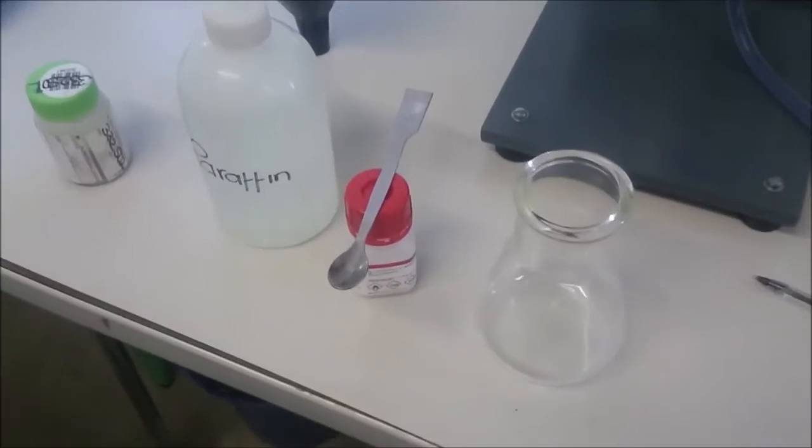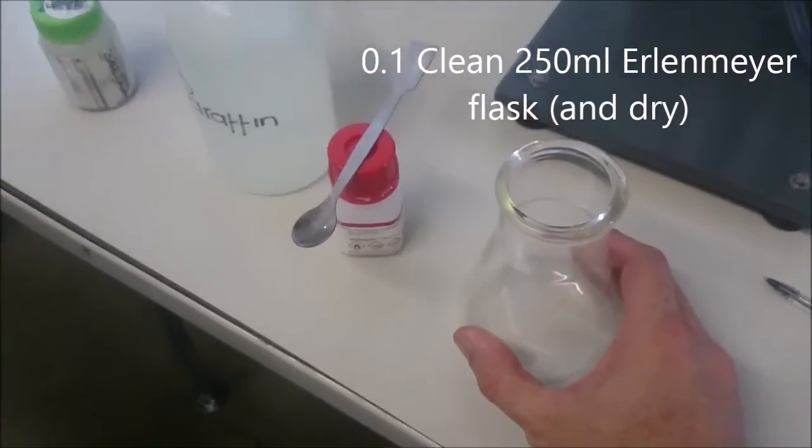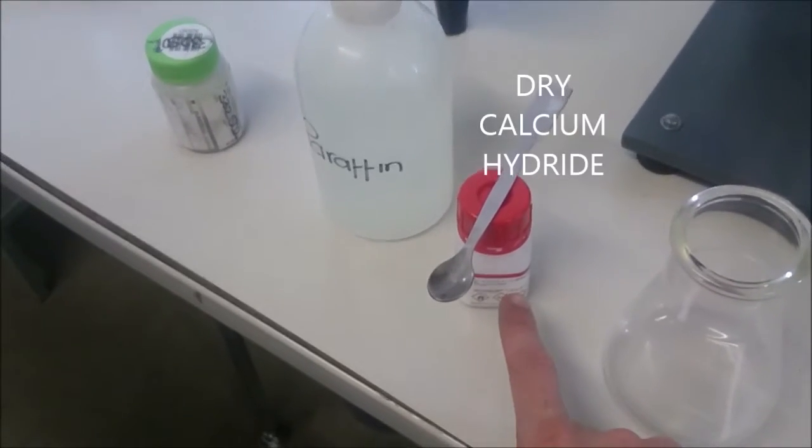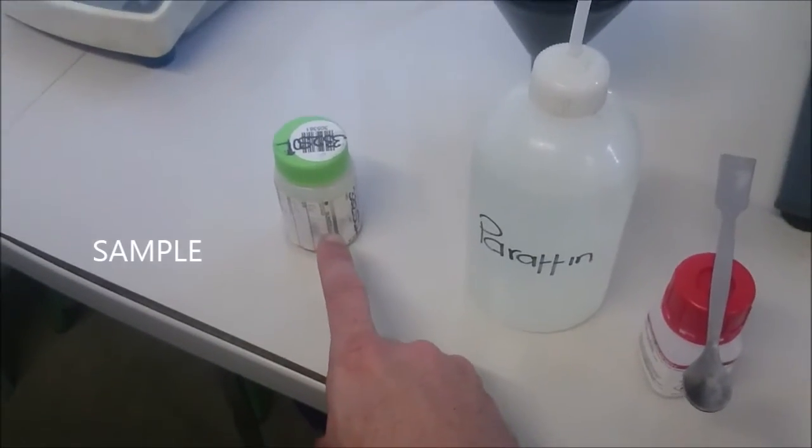So for this test, as part of our preparation, we have a clean and dry Erlenmeyer flask. We've got some calcium hydride. We've got nice clean paraffin and we have the sample that we're going to test.